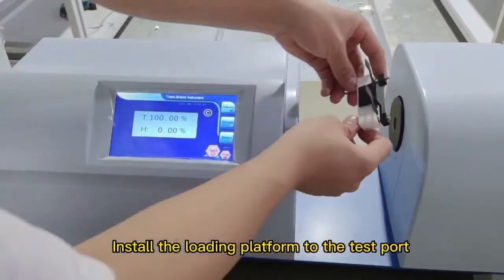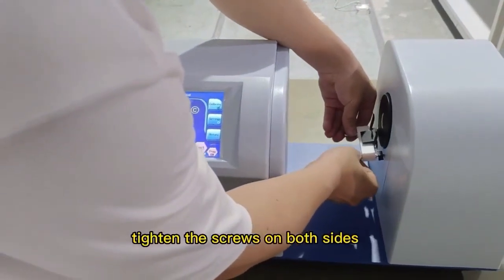Install the loading platform to the test port. Tighten the screws on both sides.